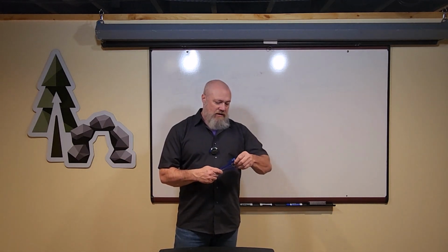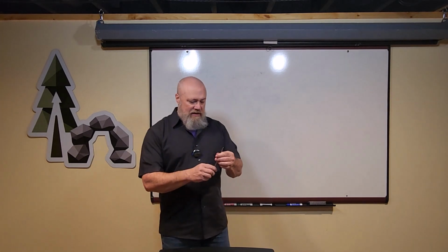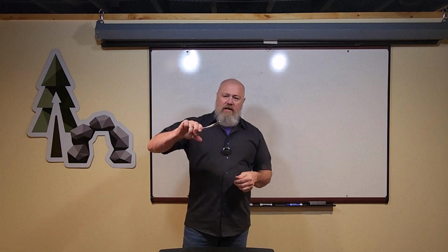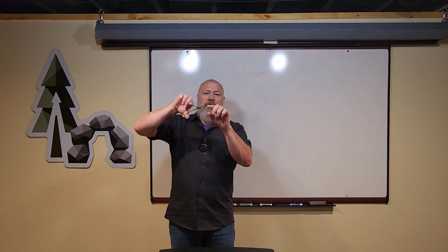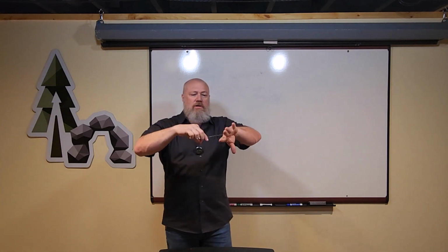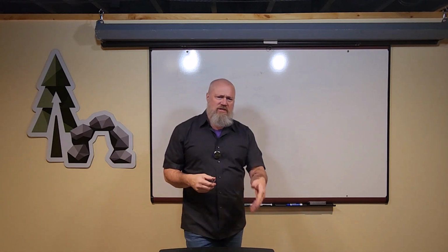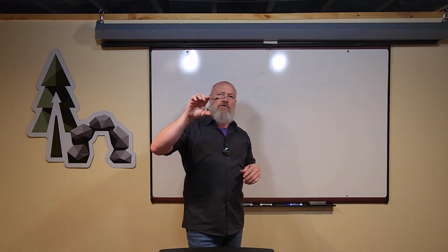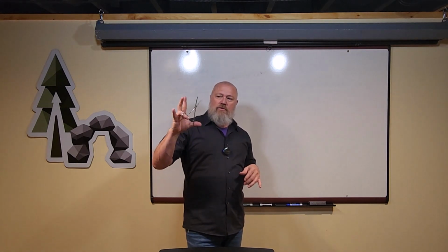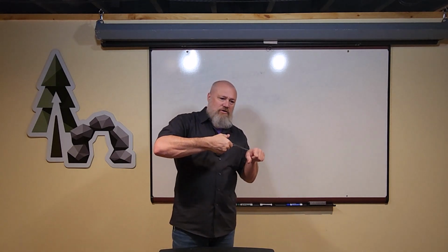Another tool that's going to come in very handy is a set of hemostats, long and short. A hemostat is basically like a little delicate pair of pliers. They're like tweezers, and this one's got little hooks on the end and a rough surface in there so it can grab hold of tissue. You can get hold of tissue and move it, especially because the skin, the fascia, and fat are pretty slippery. The hemostat goes around your fourth finger and your thumb, and then you can use your index finger to guide. It provides you a good grip.